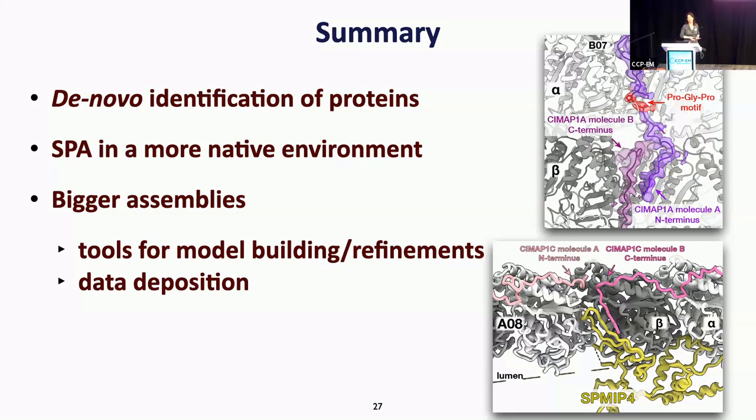For example, this 96 nanometer repeat structure, we cannot refine as a whole. We had to break it into 2 parts, and then each part takes 3 to 4 days to do the refinements. And even the cutting is not straightforward, how you divide and put them together.